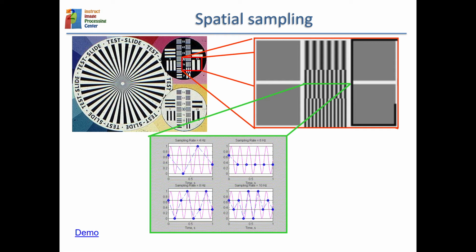You may not fulfill that condition, so you don't have any more 2 samples per period. So here, for instance, we have a period in which we have two samples, but then in the next period we only have 1. So in this period we only have this sample.